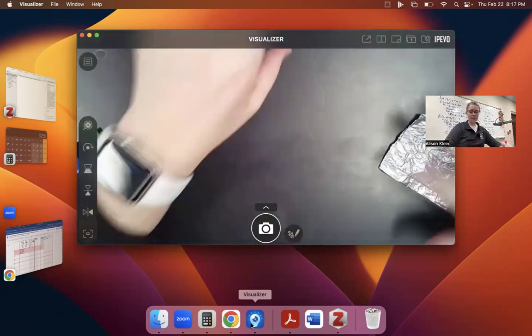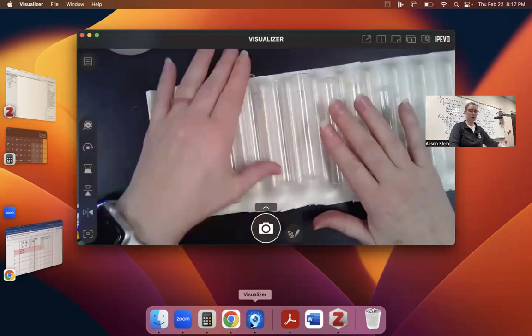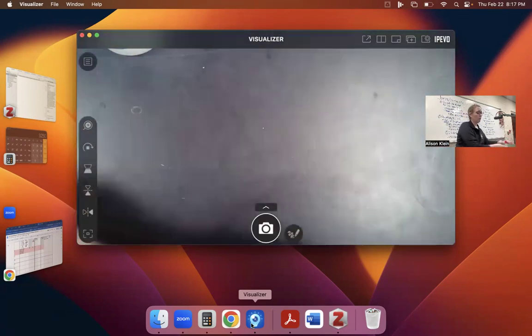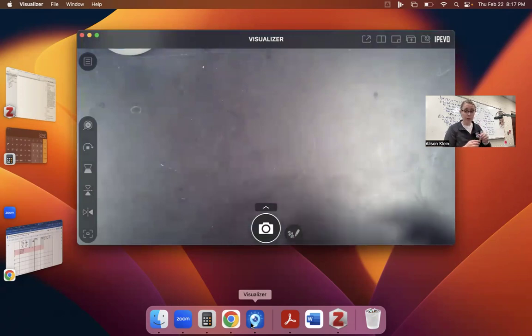Remember, when you're doing this, you're going to use solutions test tubes. These are our solutions test tubes. The test tubes are always in a test tube rack. We're always going to keep them inside of our test tube rack. And when we're doing a solutions test, it's always excess solvent, countable number of crystals.